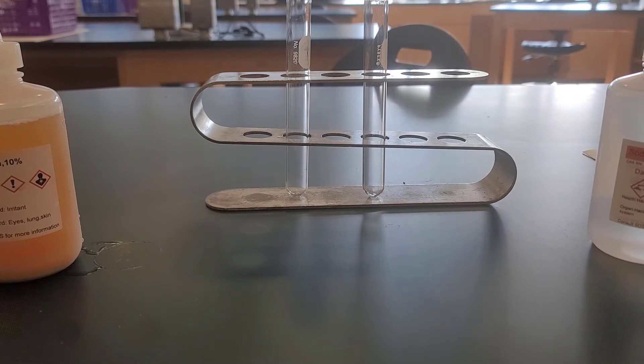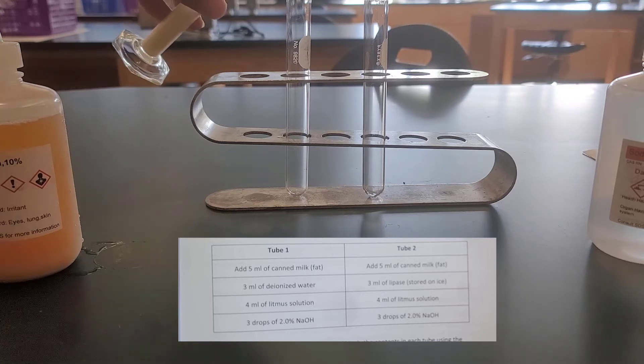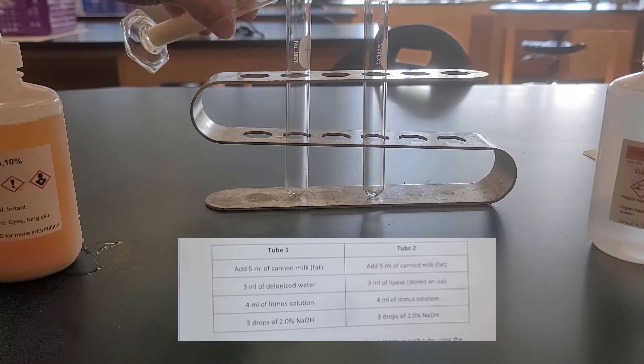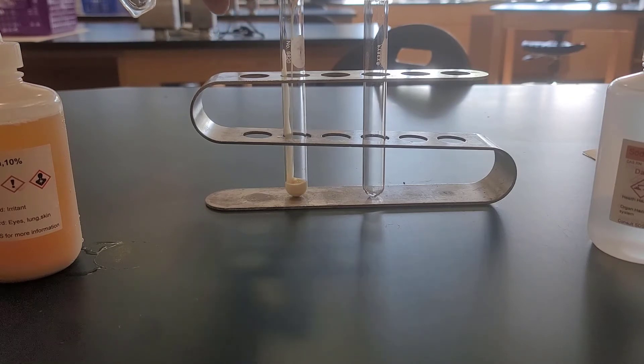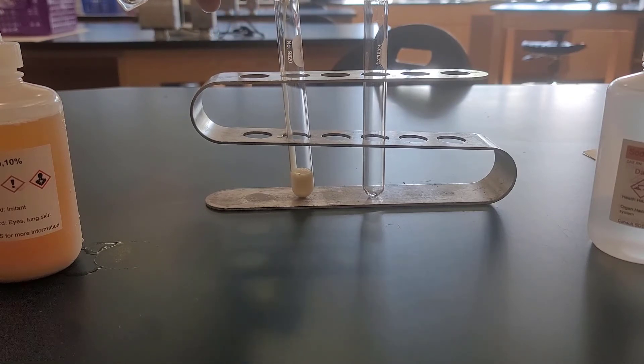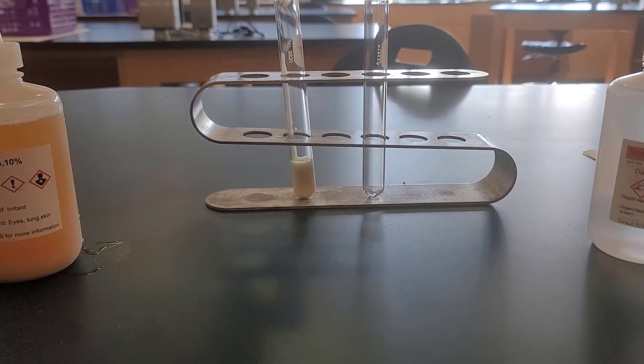So to set this one up, we're going to have two test tubes: test tube one and test tube two. In test tube one, we're going to have five milliliters of canned milk, and that's going to be the source of our fat. We're going to use three milliliters of deionized water in that test tube number one, four milliliters of litmus solution, and three drops of two percent sodium hydroxide NaOH.